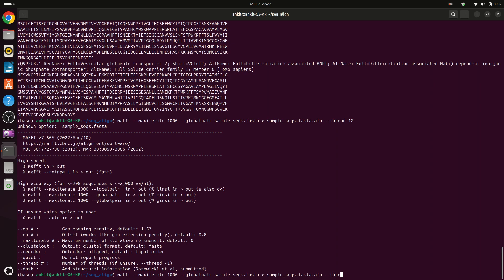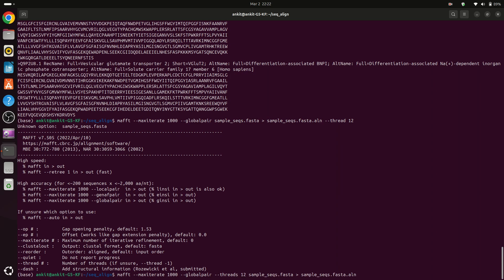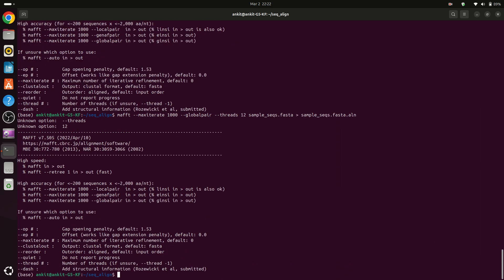So here I can type --threads, and number of threads are 12. Now press enter. Threads, okay I have typed threads but the option is thread not s in the end.